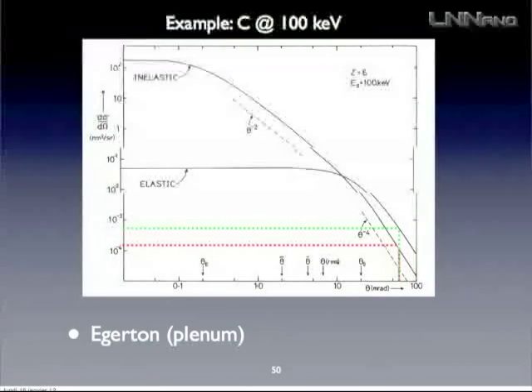Okay? So just to show you the two different inelastic and elastic signals, and how choosing the angle of detection may change things. But low angle is inelastic scattering, which is much stronger, while at high angle, this is the elastic scattering. And you see here, we are already at 100 millirad. So it's kind of a high angle.